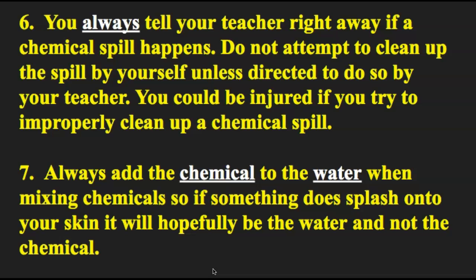Number six: you always tell your teacher right away if a chemical spill happens. Do not attempt to clean up the spill by yourself unless directed to do so by your teacher, as you could be injured. In the pre-lab we will tell you whether you or the teacher should clean it up, and we'll give you specifics about proper disposal. For labs with powerful chemicals, if you think there's a spill let me know — I'll get the materials from the chemical spill kit on the wall, get gloved up with my apron and goggles on, get you away from it, and then we'll be safe.